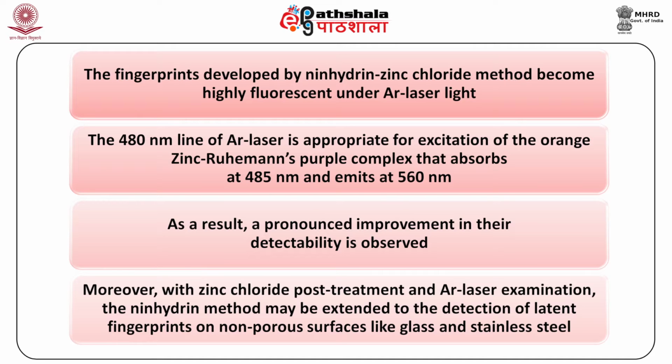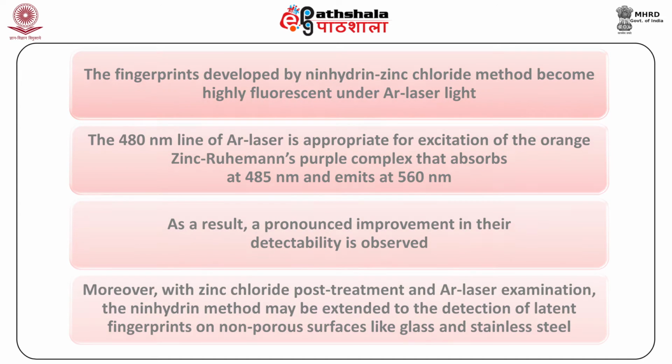Moreover, with zinc chloride post-treatment and argon laser examination, the ninhydrin method may be extended to the detection of latent fingerprints on non-porous surfaces like glass and stainless steel.